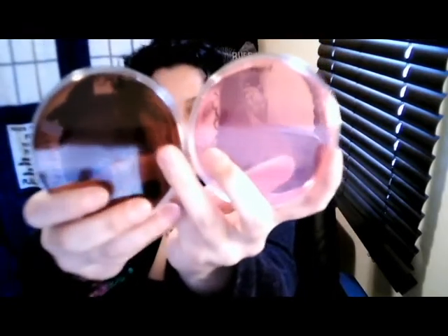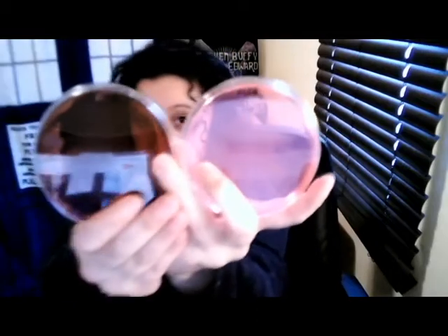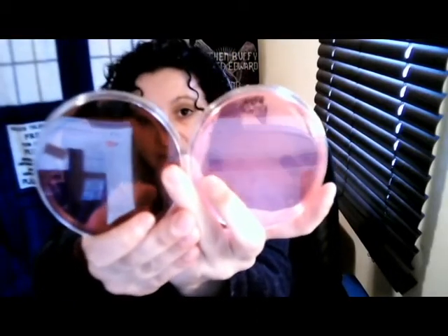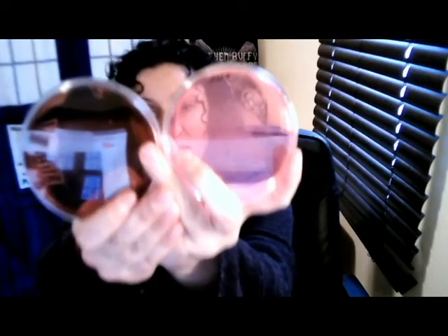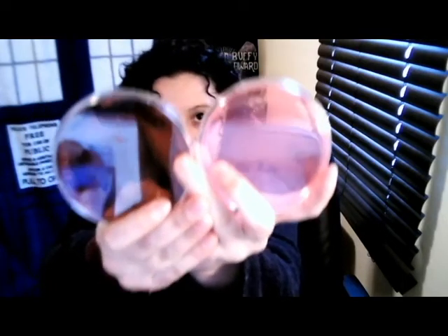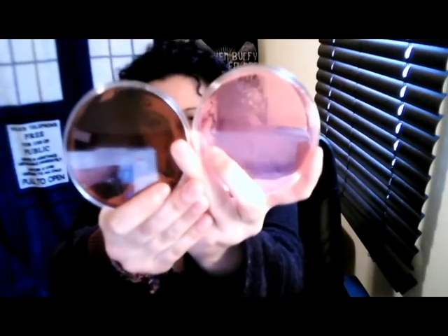You've got your MSA plate here, and I'm going to put it by the EMB plate so that you can tell that they're a little bit different in shade. Again, they're labeled up here at the top. These labels might stay there, or they might be erased. But it's not so much important that you be able to recognize them and simply know what they are based on what you're looking at. It's more important to know what kind of tests you would run on each one of these different plates.